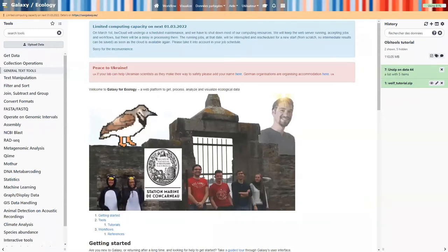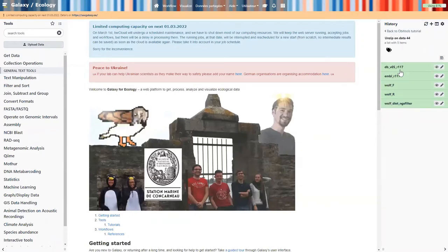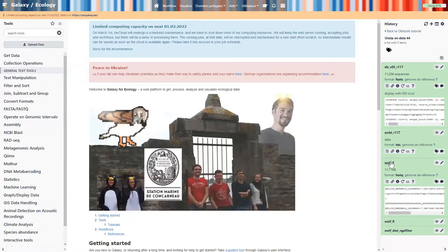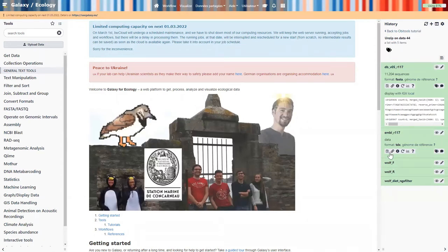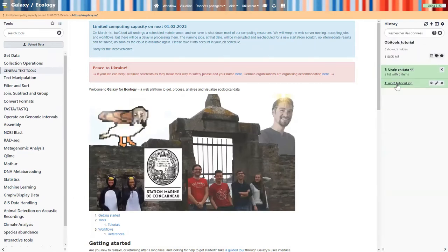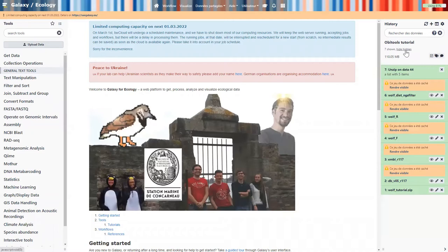Data collection is really a wonderful functionality of Galaxy to deal with a bunch of data sets and notably a huge amount of sequence files. Moreover, when you have heterogeneous data sets, as you can see here, we don't really want to consider the files as a homogeneous group of files. So we can then give access to each dataset independently for further tool executions. And to do so, we need to unhide individual datasets from the dataset collection on the history.